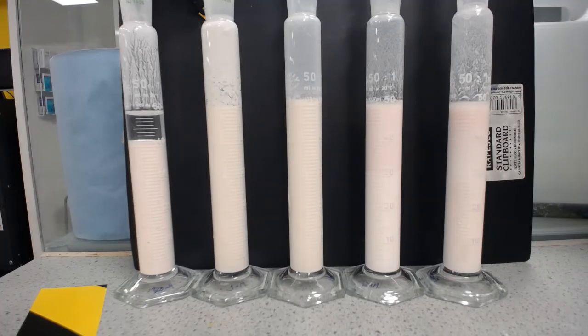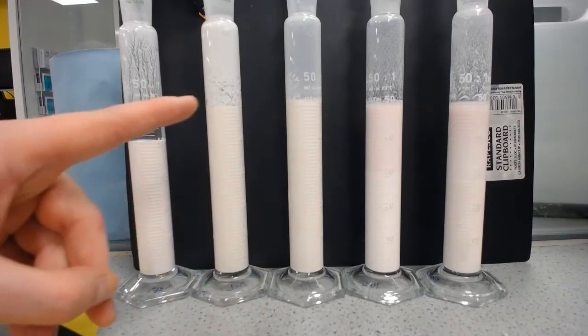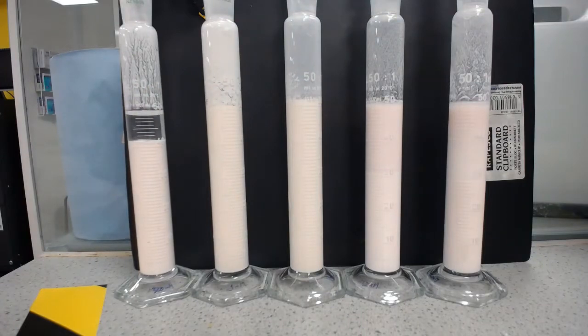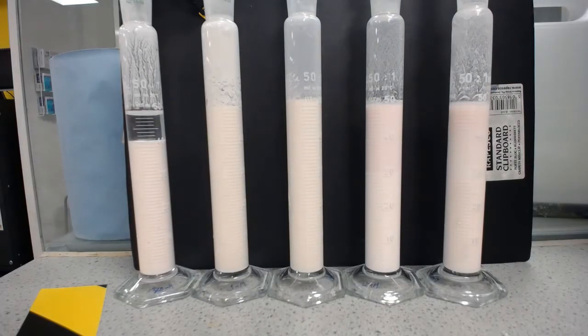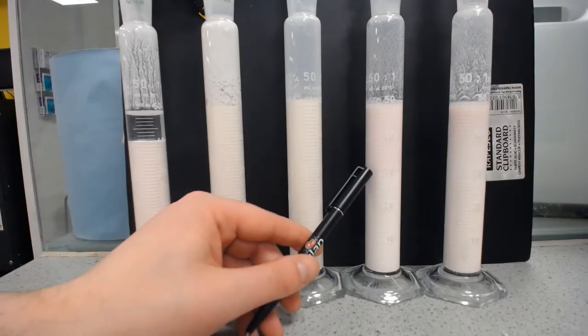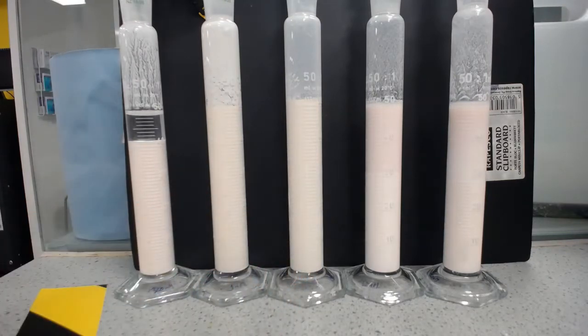Now moving on to formulation D. So formulation D, this one, what did that have in it? That has got calamine, zinc oxide and trisodium citrate, and it hasn't got any bentonite in it. So B and C have got bentonite in them, these two here, and they're the ones that look pretty stable. Now D and E, they're the ones that are being stabilised with trisodium citrate, potentially. And I think we can see a clear line here where there's a split. Maybe it's not so clear on the camera, so I'm going to move the camera closer towards these two formulations.